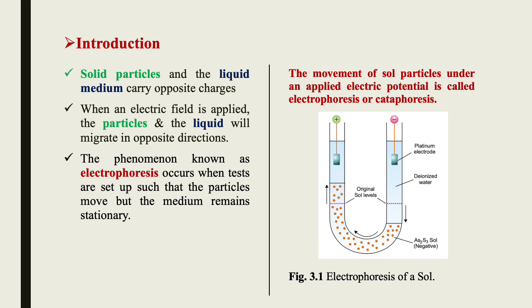The phenomenon known as electrophoresis occurs when tests are set up such that the particle moves but the medium remains stationary.